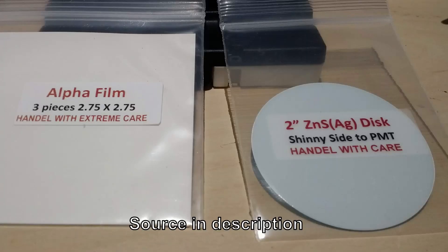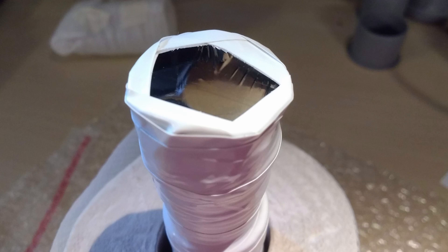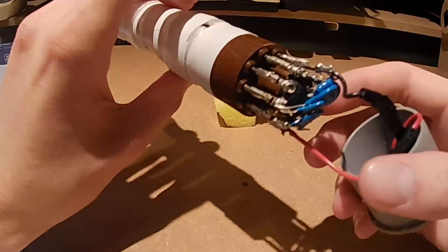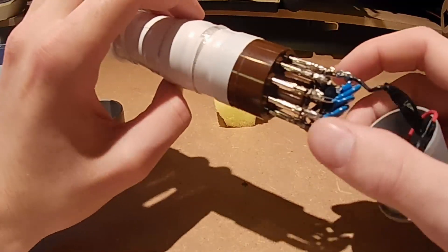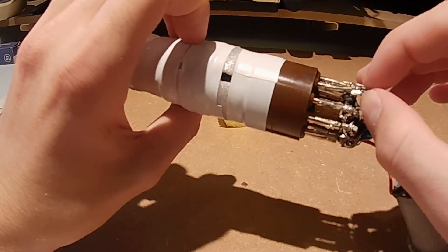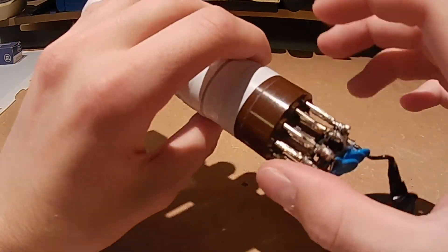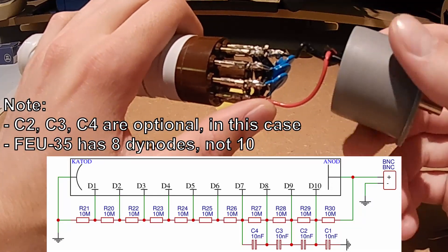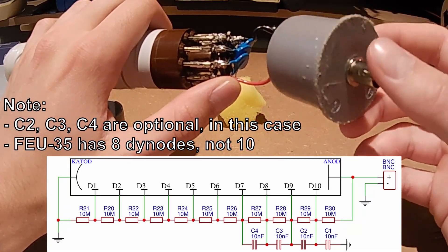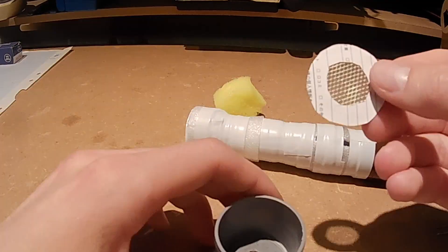After that, I put a zinc sulfide screen in front of the scintillation plastic on the business end of the scintillation detector, and covered that in two sheets of aluminized mylar, which is this shiny stuff you can see here. Then I soldered this voltage divider network to a few contacts on the photomultiplier pins — I did not solder directly to the photomultiplier pins, as that could damage the photomultiplier. This is the schematic I used, and then I also had this BNC connector that I used to connect it to different rate meters.